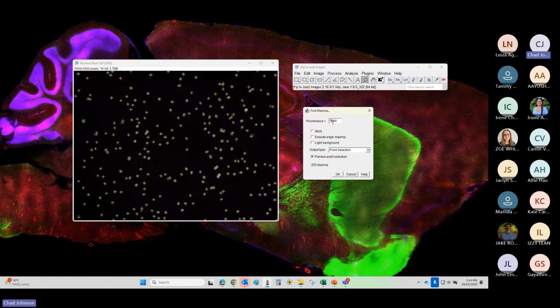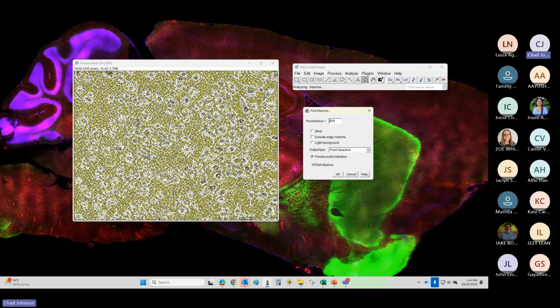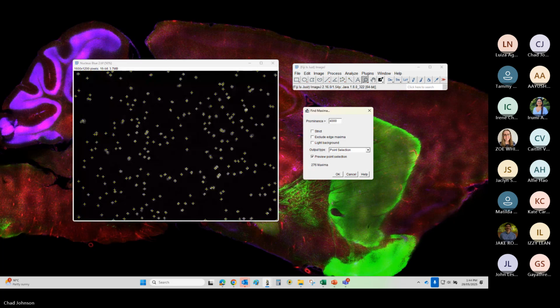So 7,000 looks okay. 6, 5. That one's got 1 now. Yeah. So okay, I'm pretty happy with 5. 3's too much. So I'm going to go with 5. 5 seems to be a good compromise. I've got most of these connected.